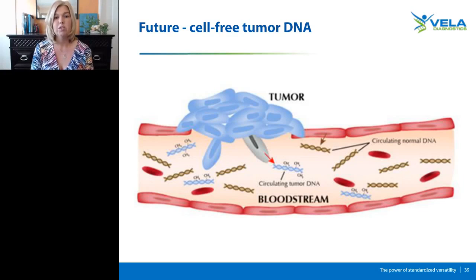Thank you so much for that, Dr. Mamoud. We actually have another question for you from an audience member. How is bioinformatics development different for use in the analysis of viral RNA versus, let's say, human DNA?